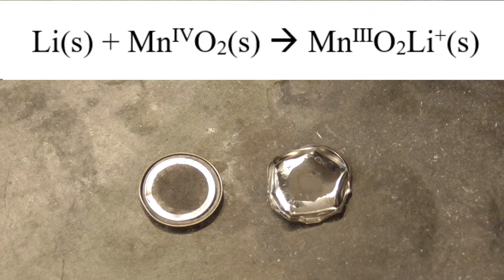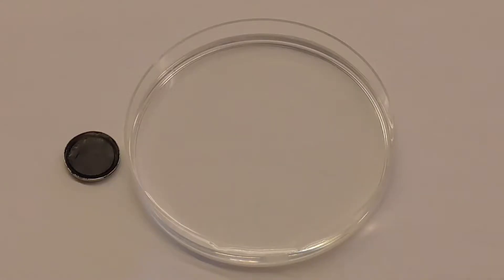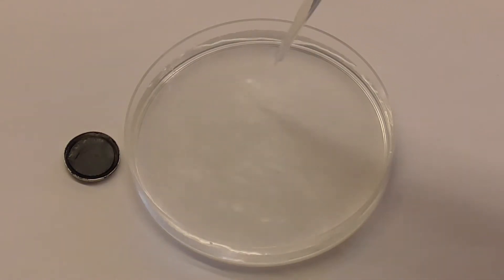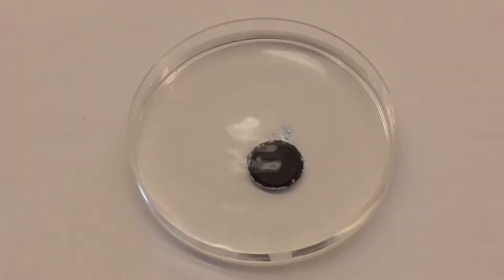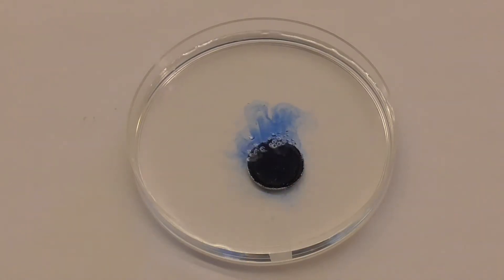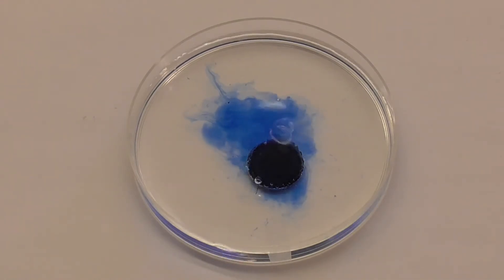It's time to test our battery. I'm going to place this piece of the battery in some water that has that special chemical in it which turns blue in a base. Let's watch what happens. Look at that! We've got bubbles and the water turns blue. A base is being formed. This is good evidence that the battery contains an alkali metal.